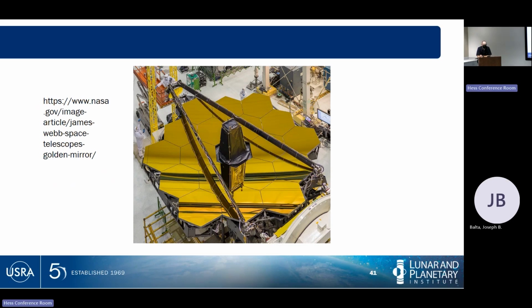You take the plate, you put it in a vacuum chamber, you pump down to a high vacuum, you run a current across gold that vaporizes the gold and deposits in a thin layer on your mirror. That is how those mirrors were designed. Any of the telescopes you ever go to will either be out in space like JWST, if it's one of these mirrored ones, or they'll have a room where they can clean and repair one of those by recoating them.